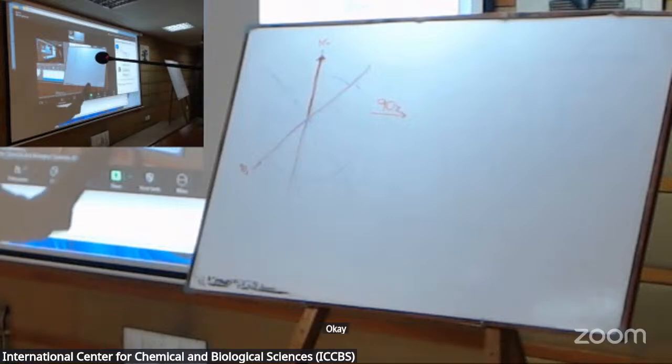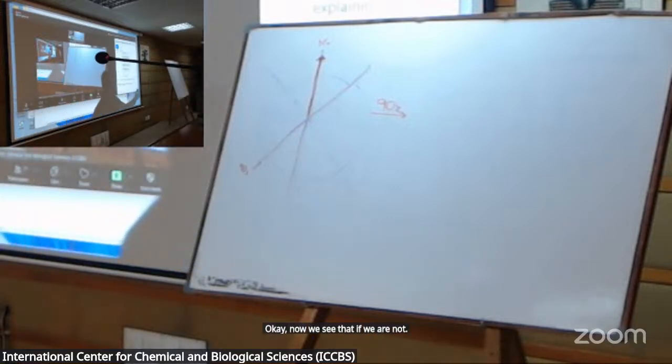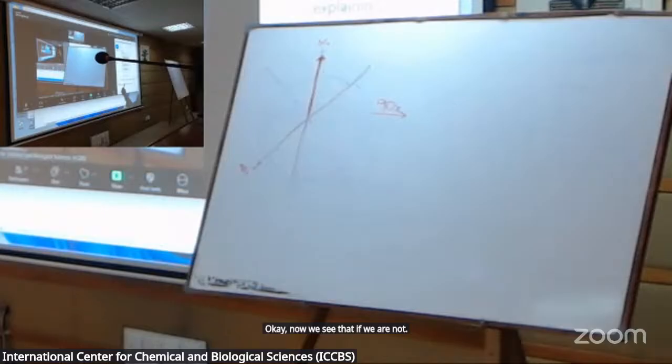Now this is the nuclei. As you saw in the last video, the nuclei randomly move around in all directions under the magnetic field. Let's say the magnetic field is in this direction, this is the Z axis.